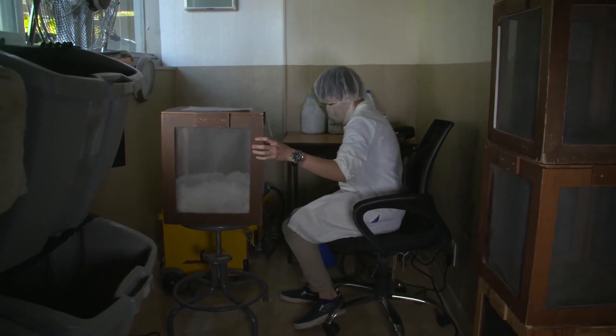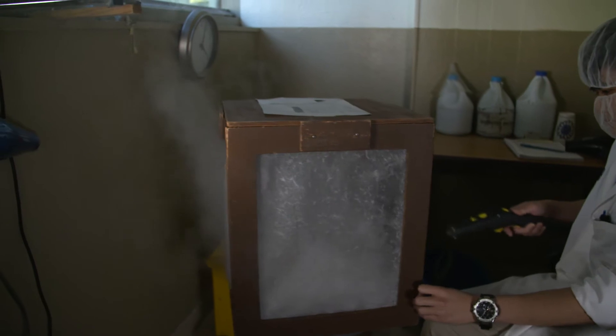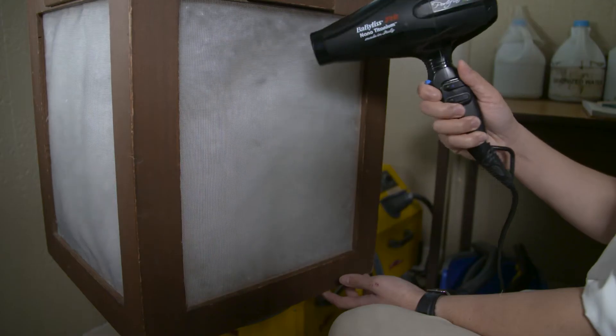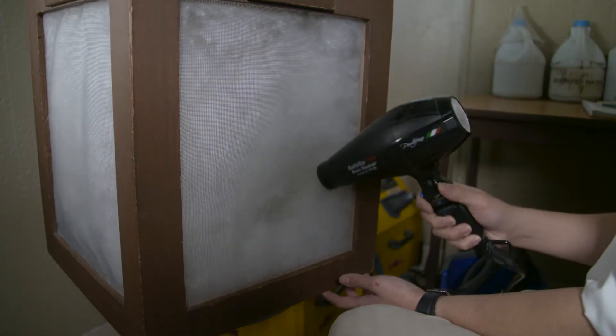When the tech receives a sample, it will empty it into a fill power box. The technician will steam the material on all four sides until it's completely saturated. Then the technician will take a dryer and blow-dry it until it's completely dry. This allows the down to return to its original state.